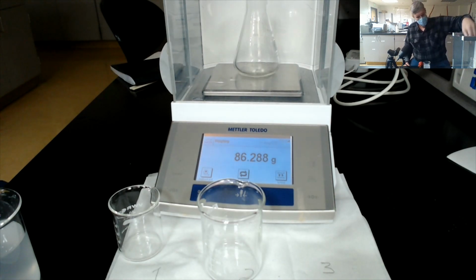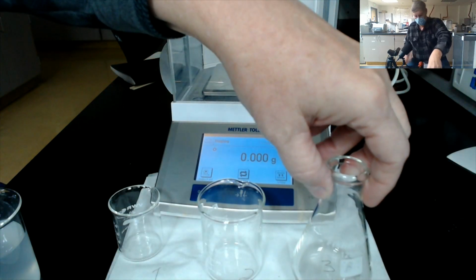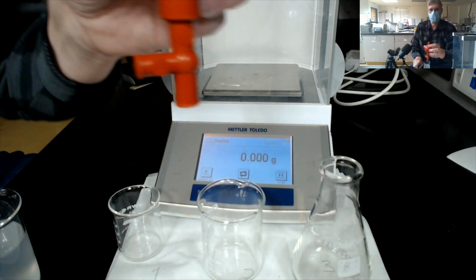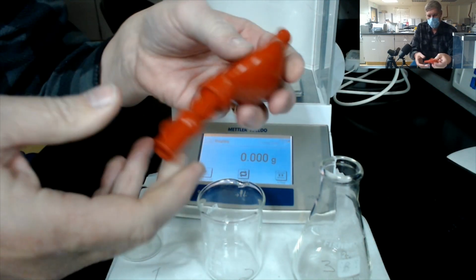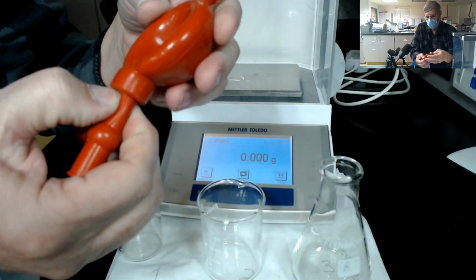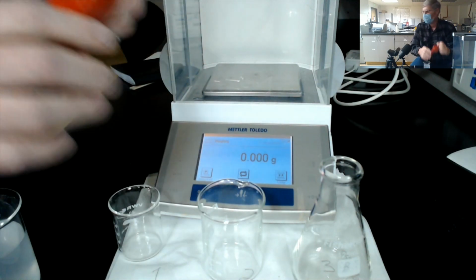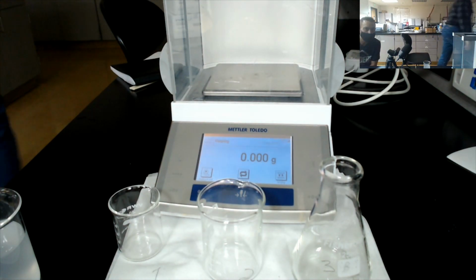All right. Now that we have recorded the 3 masses of the empty container, we need to do the pipetting. And I always like to make sure my pipette bulb actually works. So, the suction hold, this valve has been adjusted and needs to be repaired, so we need a different bulb. I will return shortly.